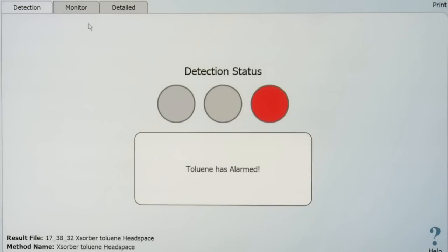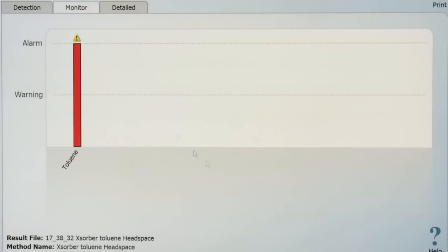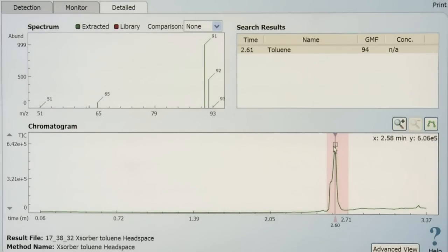You can see by the red light that the detection status has found the chemical toluene and it's showing us an alarm. From there, based on how you've trained your operators, they should know the appropriate protocol for what to do.